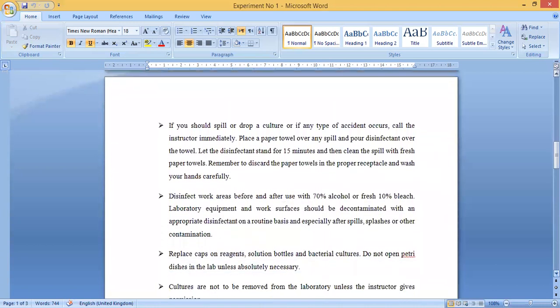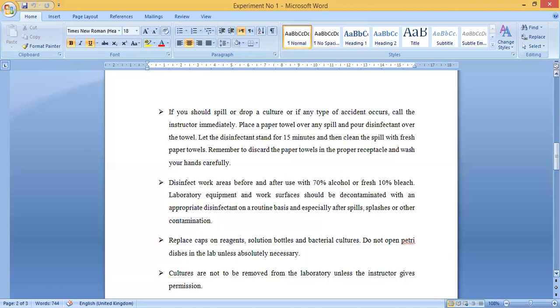If you slip or drop a culture, call the instructor immediately. Place a paper towel over any spill and pour disinfectant over the towel. Let the disinfectant stand for 15 minutes, then clean the spill with a fresh paper towel. Remember to discard the paper towel in the proper receptacle and wash your hands carefully. If any dangerous material spills, inform the lab attendant or instructor, wait until the liquid is soaked up, replace the towel with a new one, and wash your hands.